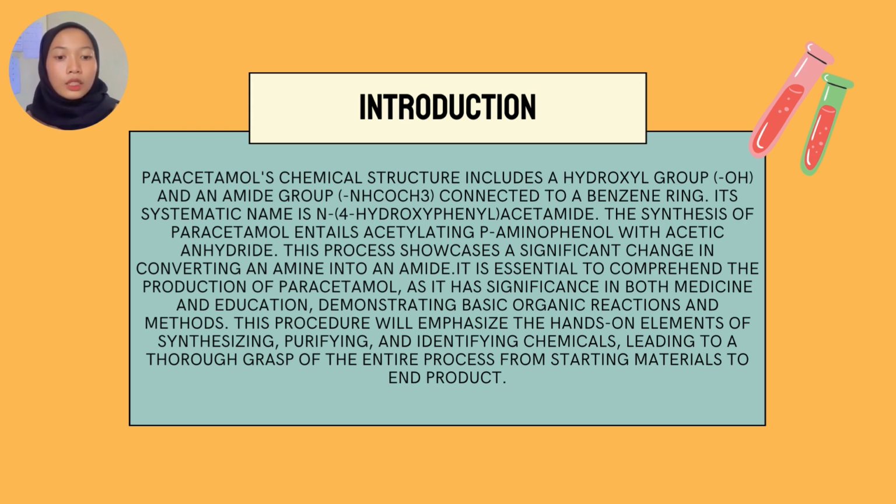It is essential to comprehend the production of paracetamol as it has significance in both medicine and education, demonstrating basic organic reactions and methods. This experiment will emphasize the hands-on elements of synthesizing, purifying, and identifying chemicals, leading to a thorough grasp of the entire process from starting materials to the end product.